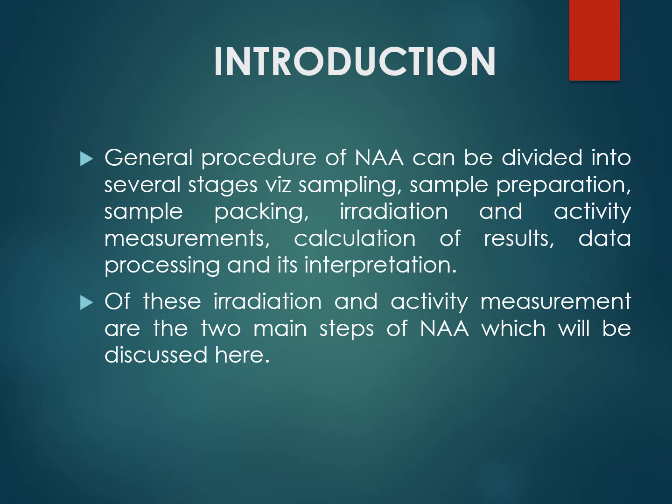How this sampling is carried out is that, for example, if we want to determine the concentration of different contents in water, and we have the water sample of a specific lake, then we will first categorize the lake into different sites and label all these sites as A, B, C and D. Then we will collect the sample from all those sites.